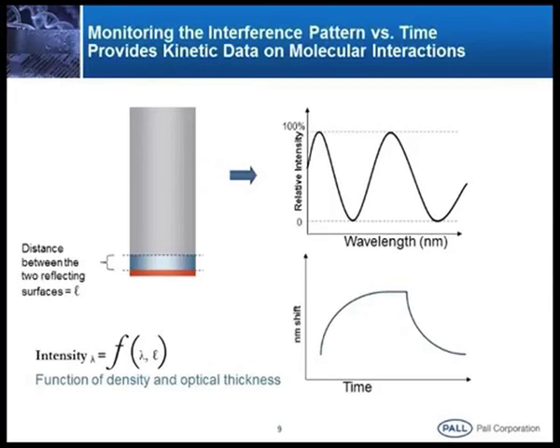Now it starts dropping in the dissociation phase. If it is like this, we call it a moderate interaction. If it is a strong interaction, like a straight line from here, we call it picomolar affinity. What exactly is picomolar affinity, nanomolar affinity or micromolar affinity?